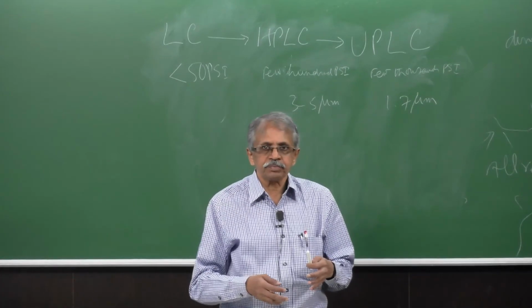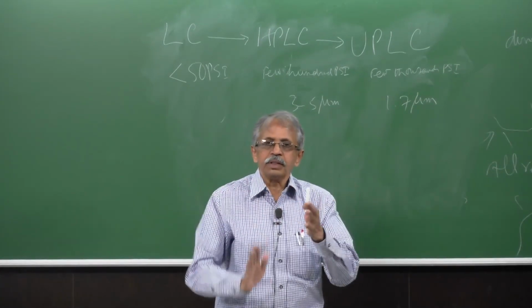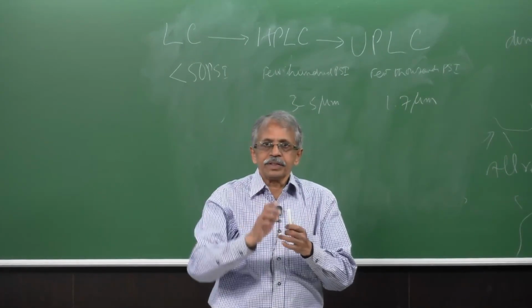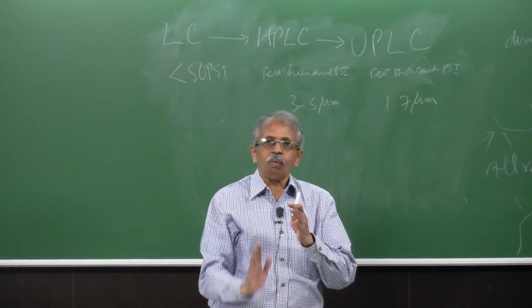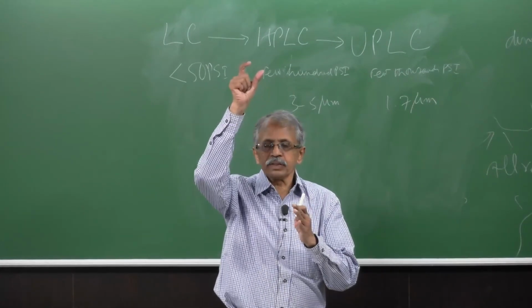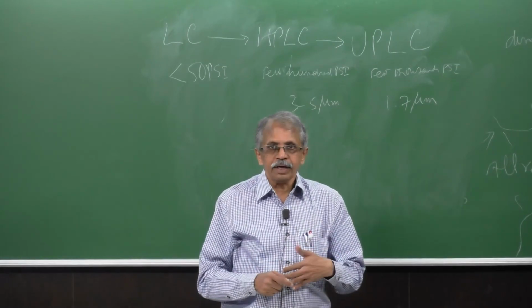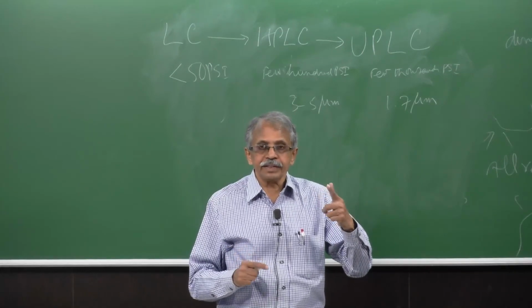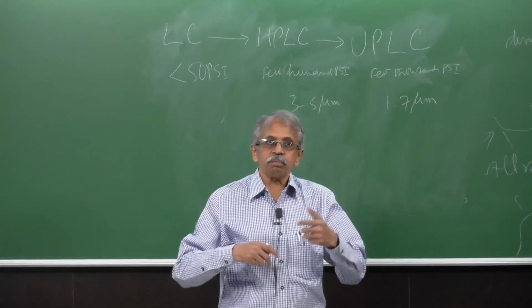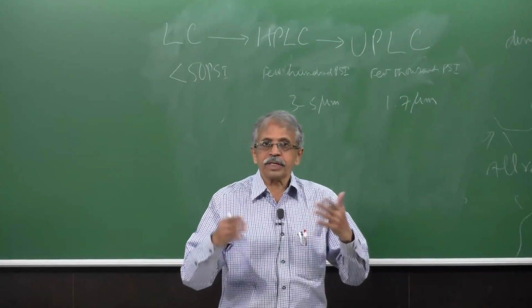Sharper means sensitive, resolve means peaks getting separated out, that is called resolution. On the x axis the separation will be resolution, on the y axis getting taller is the sensitivity. So, sensitivity and resolution, how to improve both of them, and at the same time one more thing hidden is how long it takes. One sample taking a whole day, one sample taking 1 hour, one sample taking 1 minute.